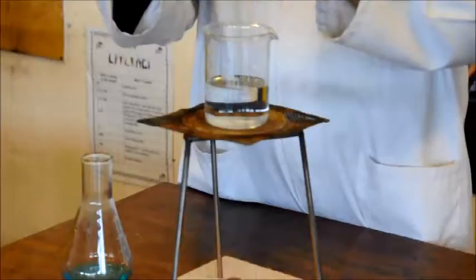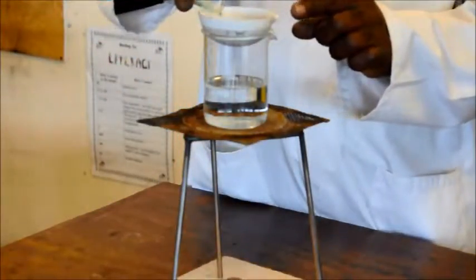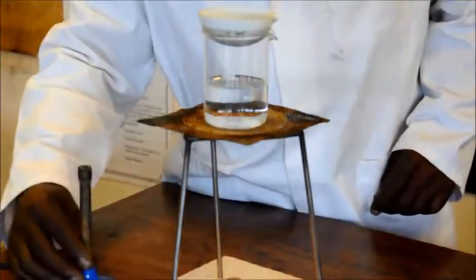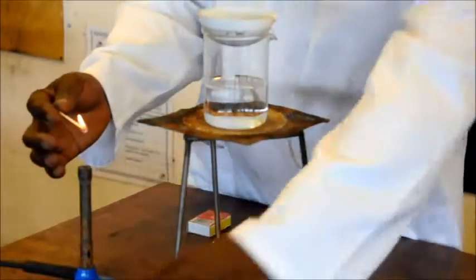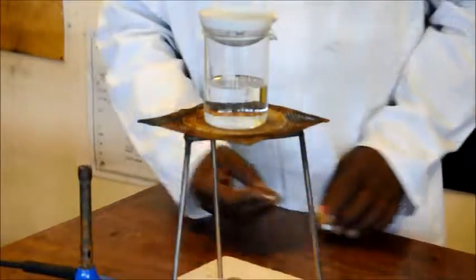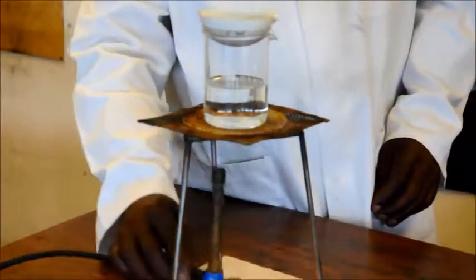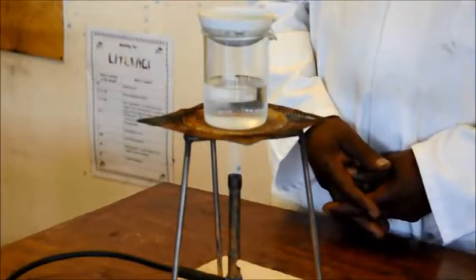And there's our evaporating basin where our copper sulfate solution will go. So I'll start that going. Pour that straight in now. Fine. Bunsen burner. Light it. And away it goes. I'm going to use a strong blue flame to speed things up.